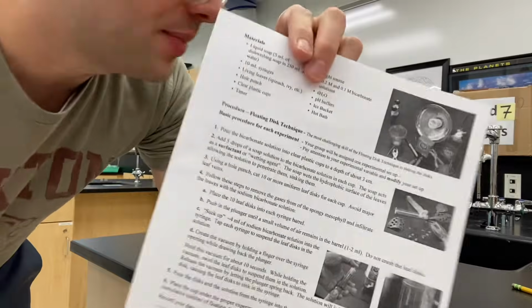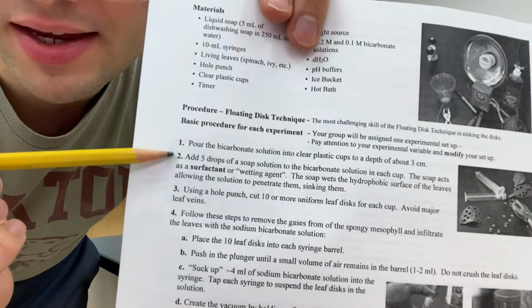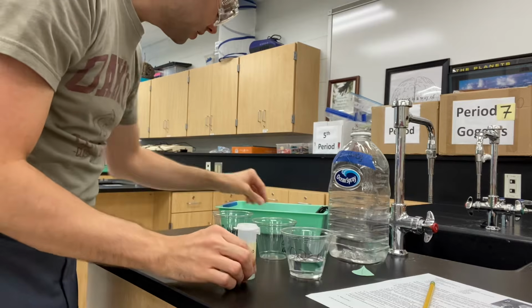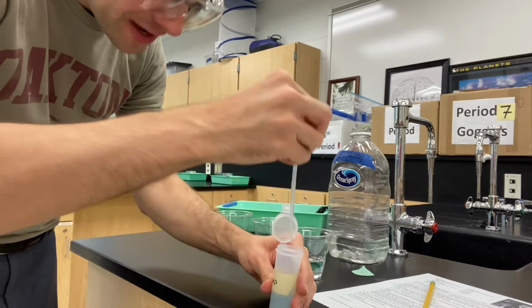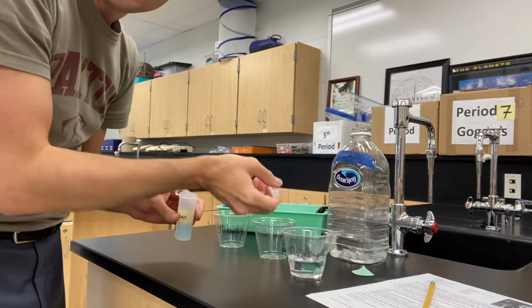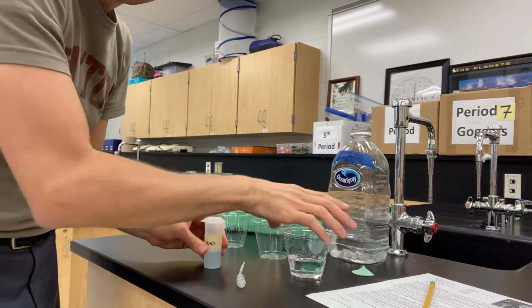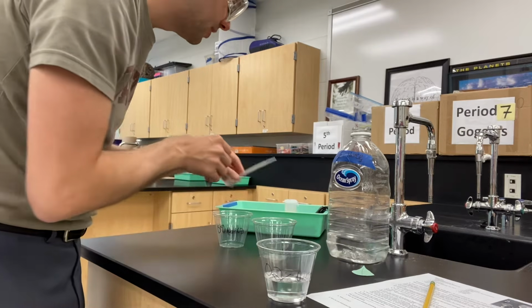The second step in your procedure is an important one, but it is easy to skip. Do not forget to add these 5 drops of soap. You will also see soap in your green setup trays. You're going to add 5 drops of that, again, to each one of these 3 plastic cups. I'm just going to do it to this one, and I'm only going to use this one in the video just to make it a little bit simpler.